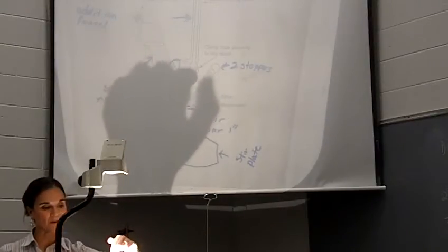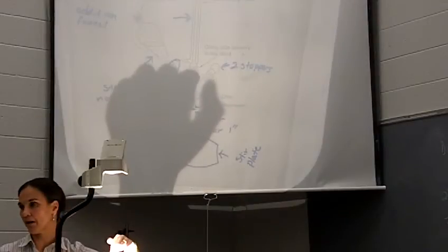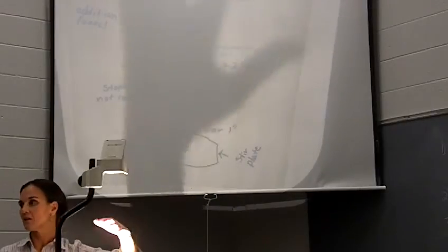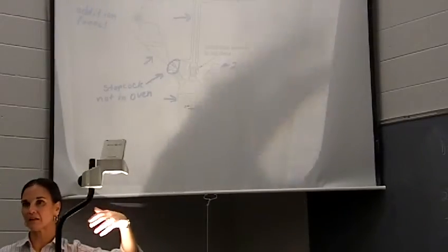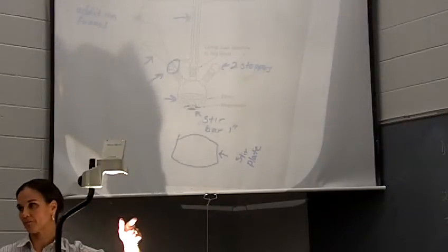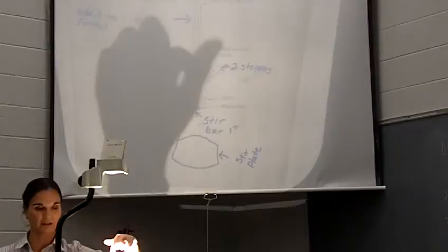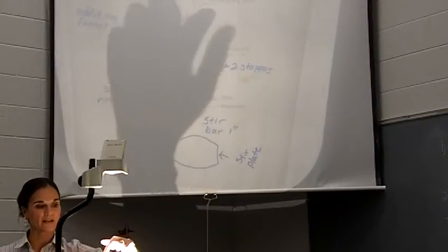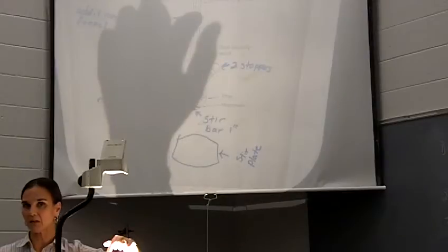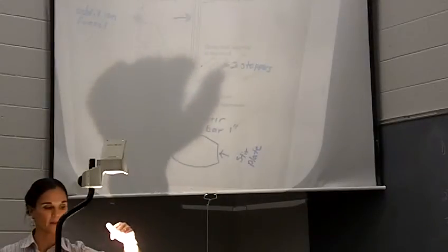You're going to clamp your round bottom flask right on its neck. Make sure it is clamped well. This apparatus, we're going to move up and down a lot, depending on what we're doing with heating throughout the process of the Grignard reagent formation and the Grignard reaction. Okay, so you want it clamped well here. You also want a support clamp on the condenser, but you don't want it to be tight because you need to move your apparatus up and down.